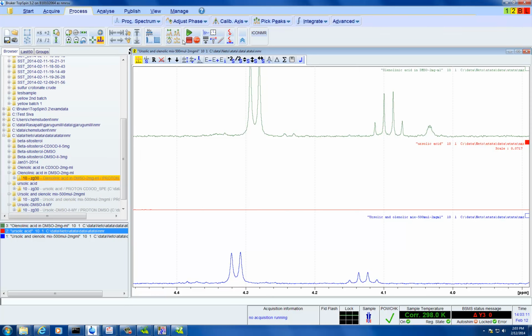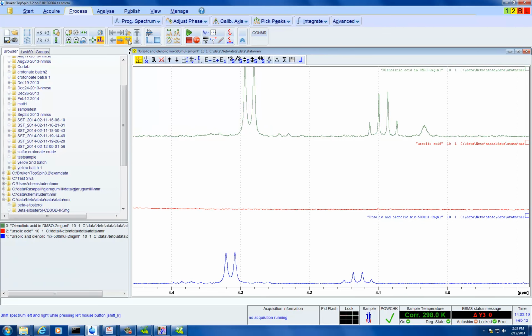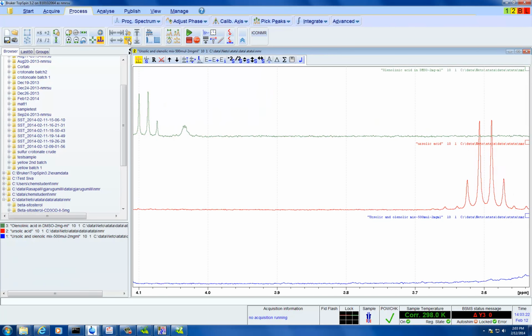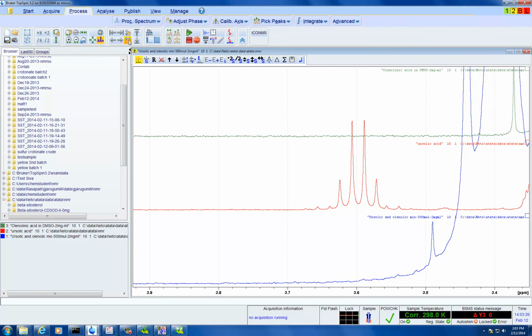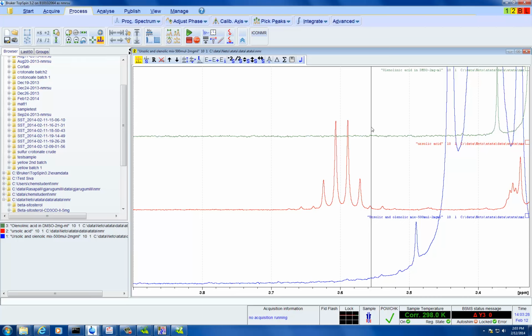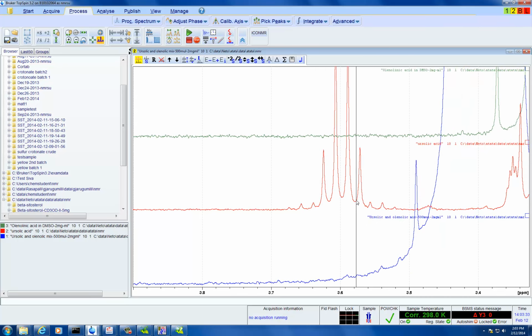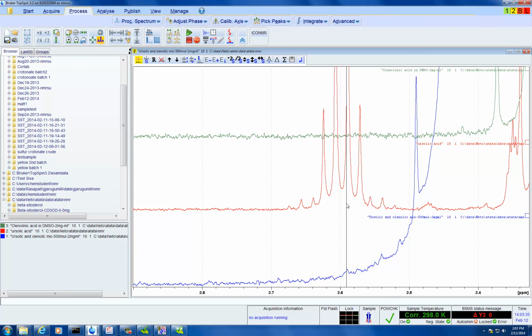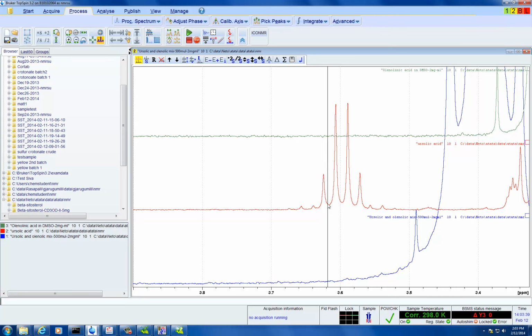So then if we keep focusing on other areas, somewhere you can see here that ursolic will have it and oleanolic acid would not have. You can quantify this multiplet. And I think some of these are carbon satellites, so I think it's more just these 4 peaks.